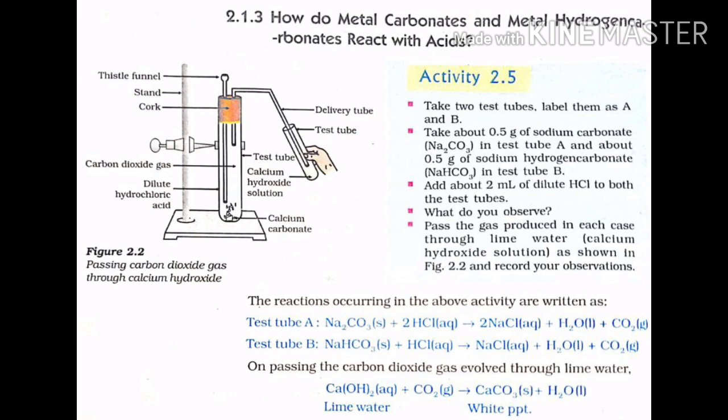What do you observe? Pass the gas produced in each case through lime water, that is calcium hydroxide solution, as shown in figure 2.2, and record your observations.